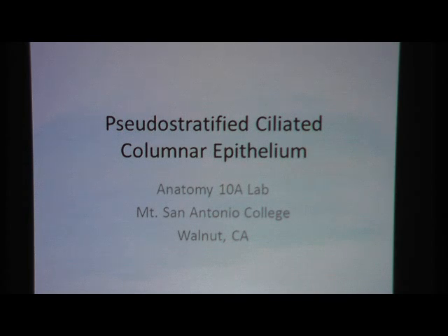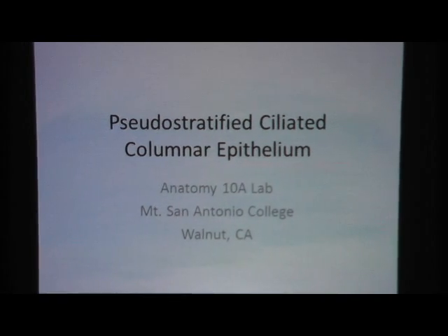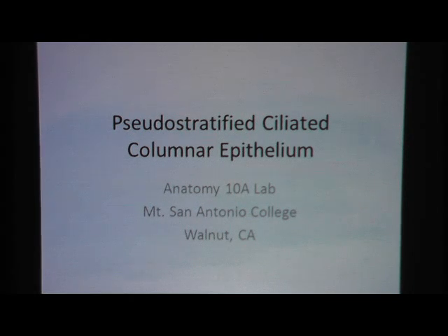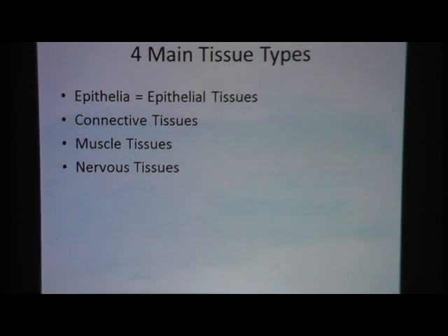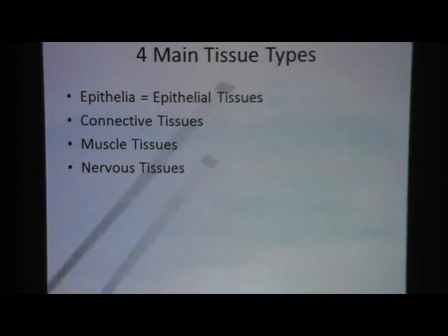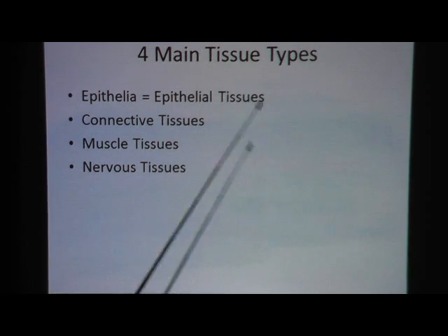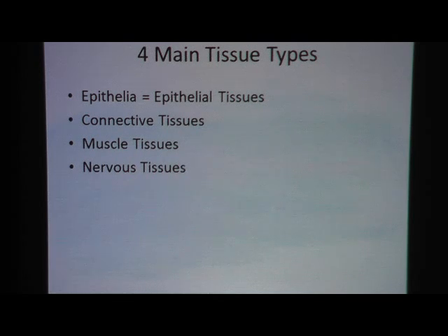Pseudo-stratified ciliated columnar epithelium. These slides are made from an Anatomy 10A lab at Mount San Antonio College. We review the four main tissue types: epithelial tissues, connective tissues, muscle tissues, and nervous tissue. Remember, the entire body can be broken down and fit into one of these tissue types, no matter where you are in the body.